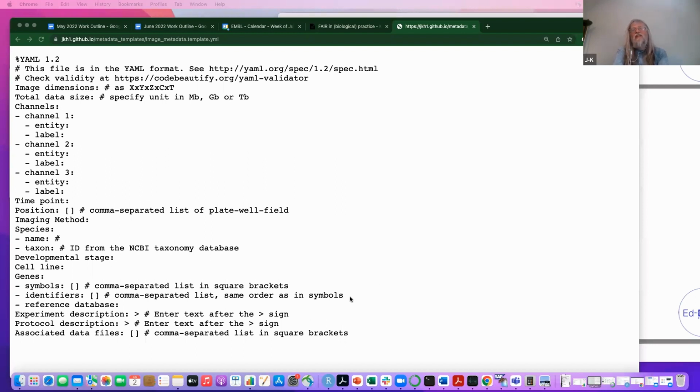If I have this type of metadata coming from images, then it's easy to convert to what is required for data deposition, because this is the minimum that they need, but it needs to be associated with images in slightly different formats. That makes it easier to script than manually filling out forms and spreadsheets.